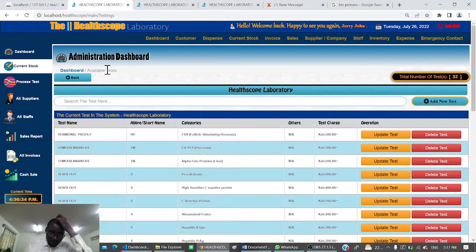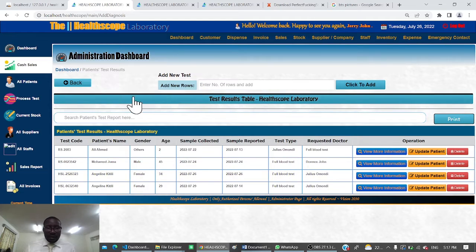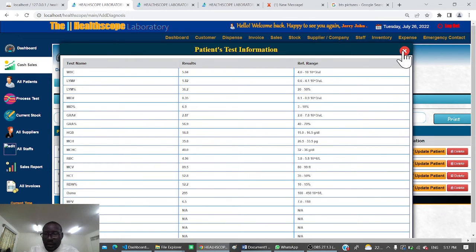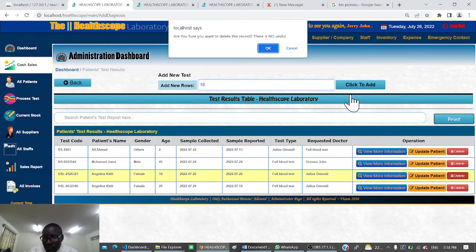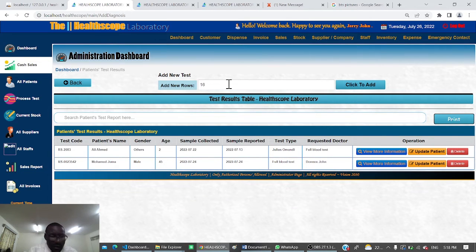But before that, maybe I can go to the new page and process the test, or I mean add. I think we added one. Let us use this one here, or we can add. If I come here, I just add how many. So I can delete this one and remove this one like that. And then I want 16, right? So just click add like that.